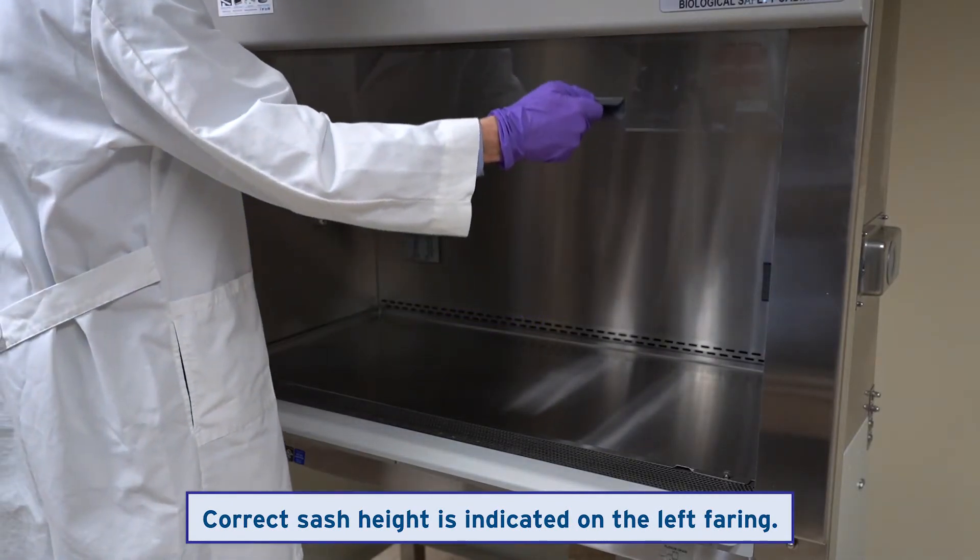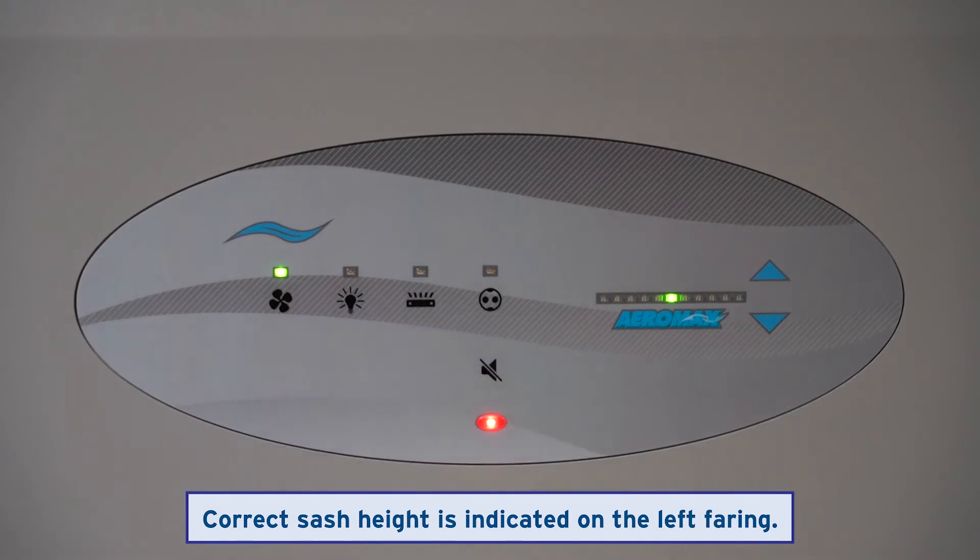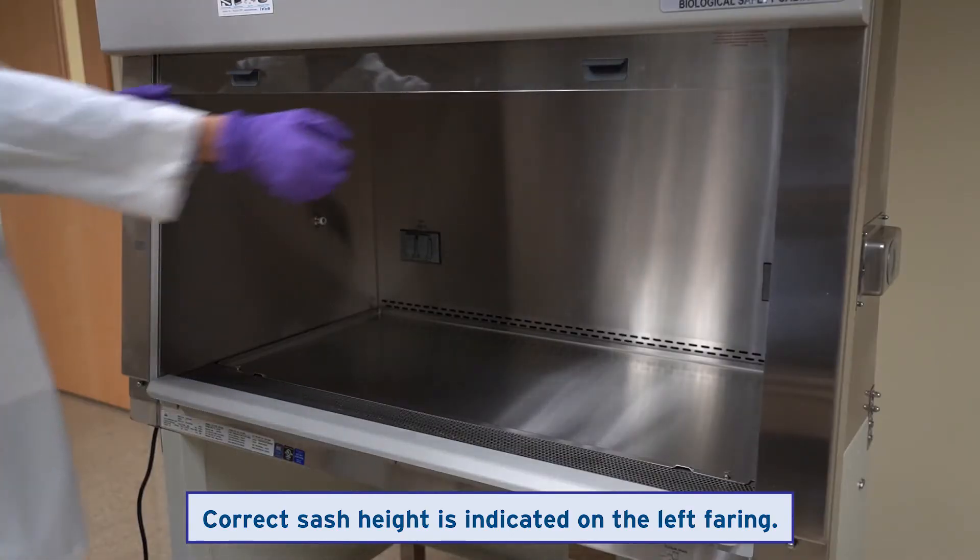An alarm will sound if the sash is raised above the working height. Silence the alarm if cleaning, but return the sash to the correct height before working inside it.